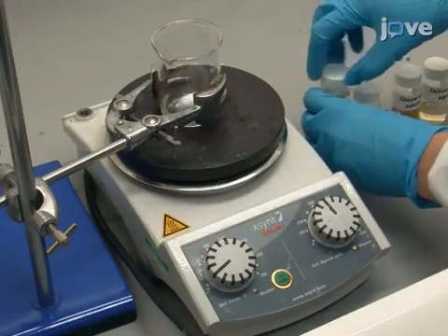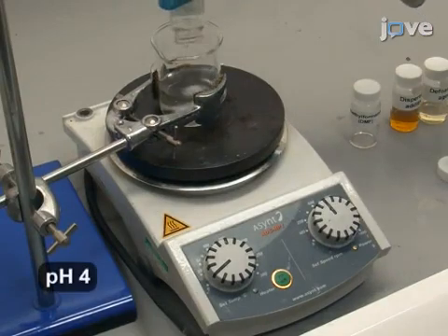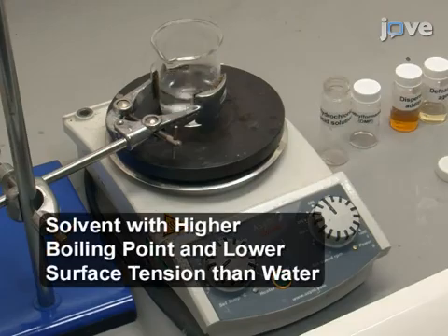To begin the ink formulation process, first add 32 grams of a 0.1 millimolar aqueous solution of hydrochloric acid to 8 grams of a compatible solvent such as dimethylformamide.